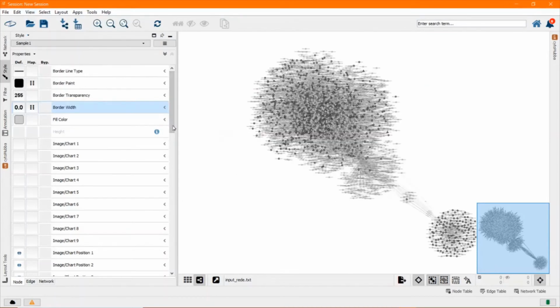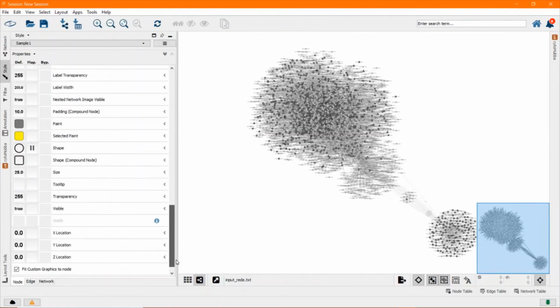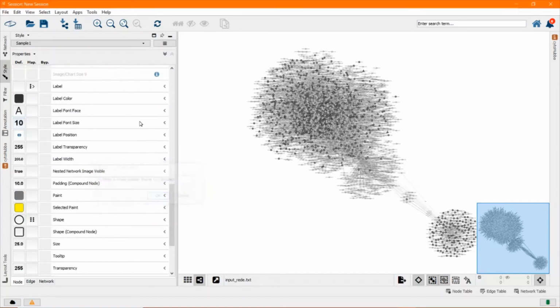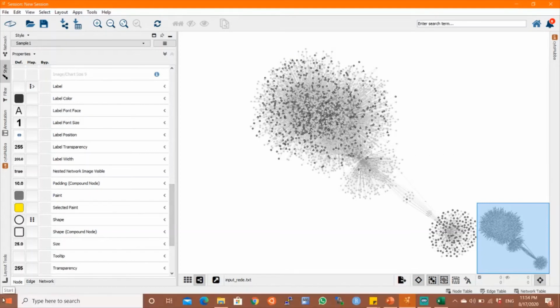Okay, so everything is a lot of things. I like to change here for 1. It's the label font size. So it makes it better, okay? So everything that's written inside of these forms is very little now, so you can see everything. So contour and format, okay. Now colors.